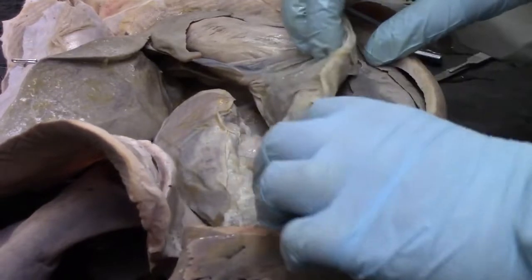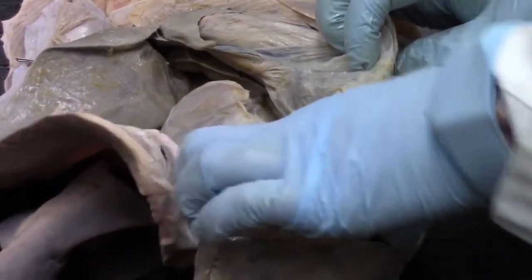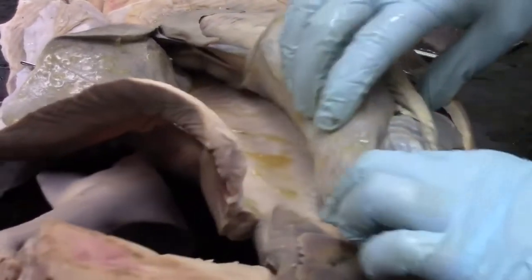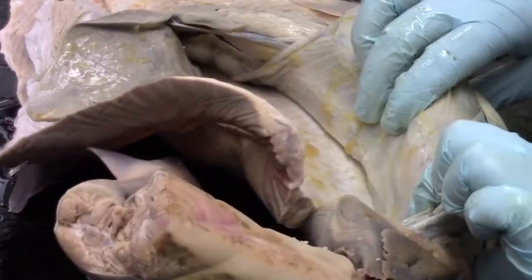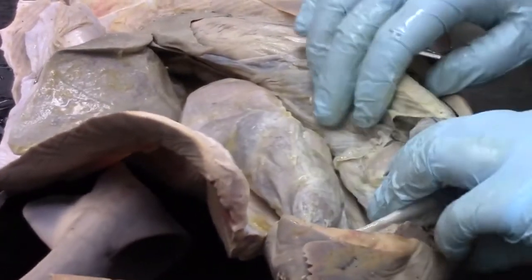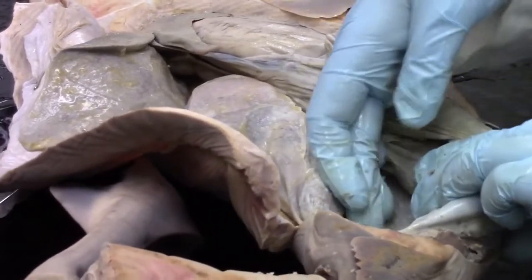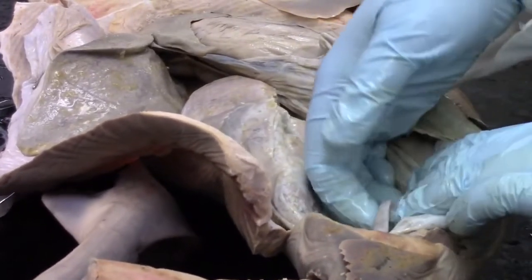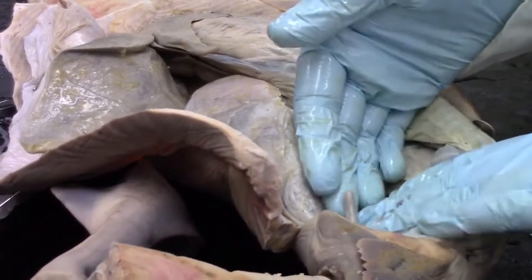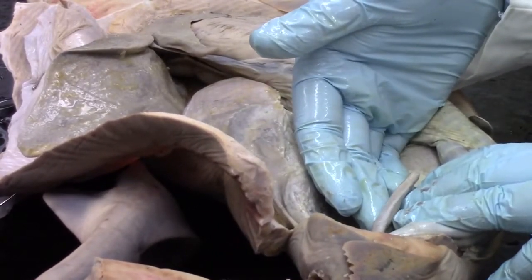And then it's probably going to be a little difficult to find just because there's a whole lot going on down here. But we will also be able to find that rectal gland. There we go. I think it's a little bit too underneath for you to see. Oh, there we go. There's our rectal gland, that gland for salt regulation.